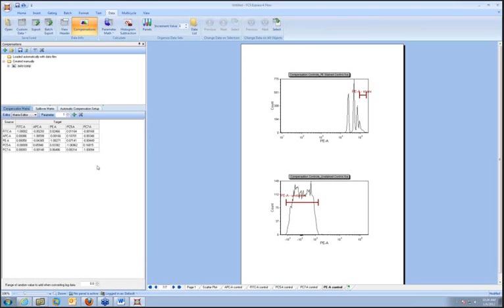We did get a question: why are we not adjusting the marker for our stained controls? The only reason I didn't is because they're fine for our purposes. If we wanted to adjust them, for instance, if you thought this really should be bigger, you can adjust them there. Normally, you want to take the brightest of your cells from the positive population. So I just left it as that, but it's really up to you to do whatever you want. And so you can see here that in a few clicks, we actually just created our matrix.